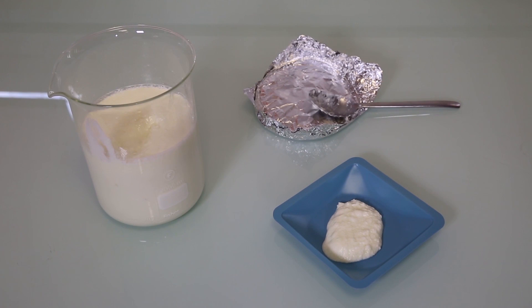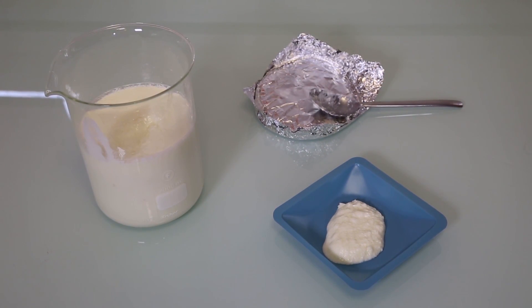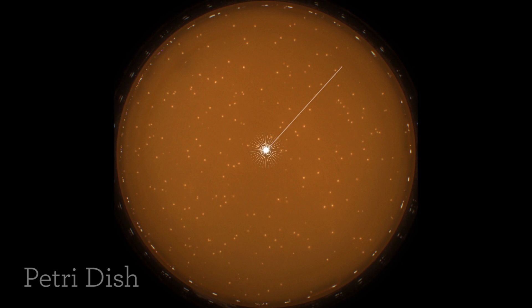But it's rare that you'll see how many bacteria are in the yogurt. Yogurt can contain up to several hundred billion colony-forming units, or CFUs, per serving. A CFU is basically a live bacterial cell that can grow and multiply into a colony if you put it onto a petri dish.